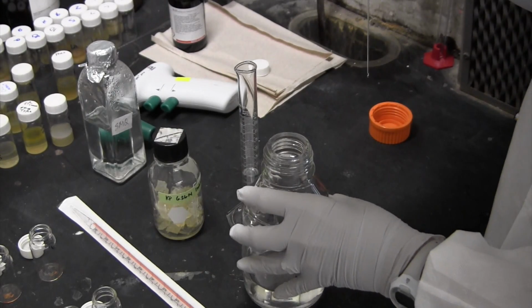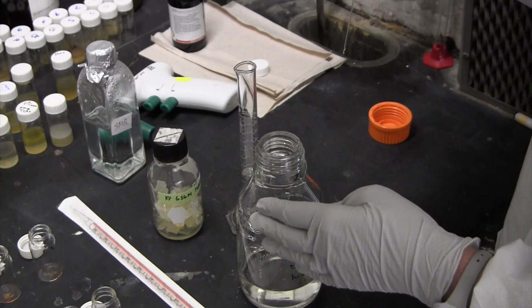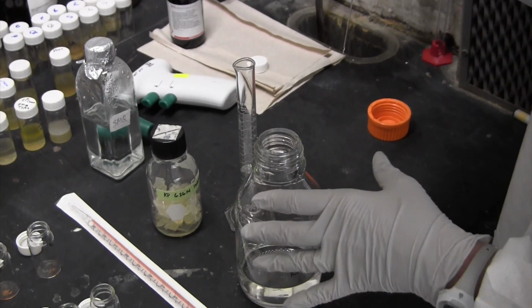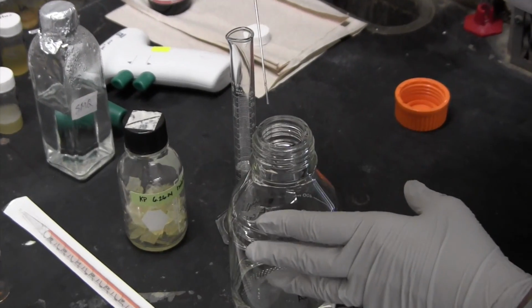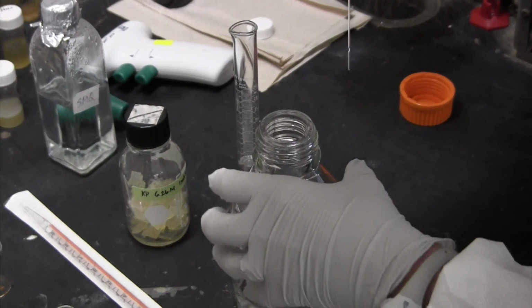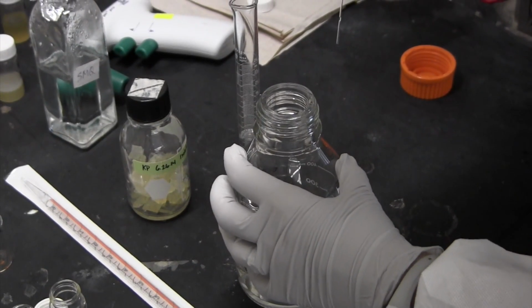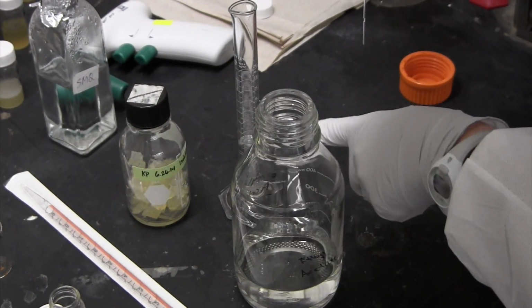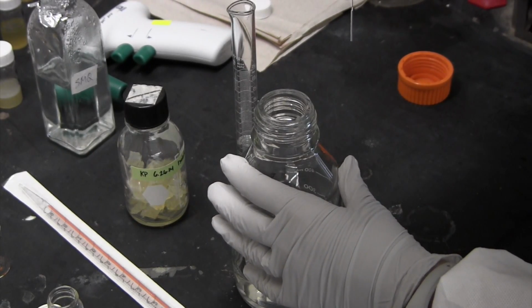So this step, a couple of things. This is definitely something to do in a fume hood, so you're going to want to be sure that you're working in a fume hood for the addition of ethyl acetate, and that everything you're working with is glass, including the pipettes that you're going to use. Our ethyl acetate has been aliquoted into a smaller working stock jar that you can see here, and I'm just filling up this glass graduated cylinder until I have 12 mLs of ethyl acetate.